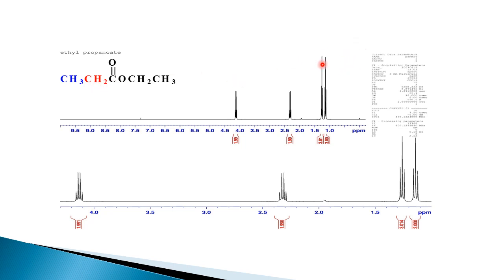Okay, the rest of the peaks, that is these 2 peaks, are due to the methyl protons. But we can't say precisely which methyl proton has given rise to which peak, or which peak is due to which methyl group. So in such cases we will look for HMBC spectrum to show the connectivity and to solve the problem.